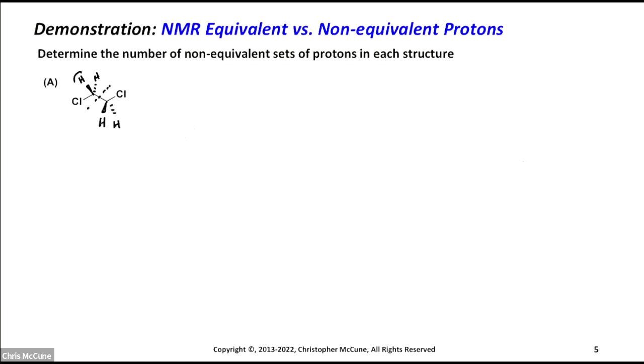And you want to know, are these two protons NMR equivalent or NMR unequivalent? And so let's test that with our deuterium replacement test. So I'm going to redraw two times. The first time I'm going to replace one of the hydrogens with a deuterium. And the second time I'll replace the other one. Okay, and then I'm going to compare those two structures.